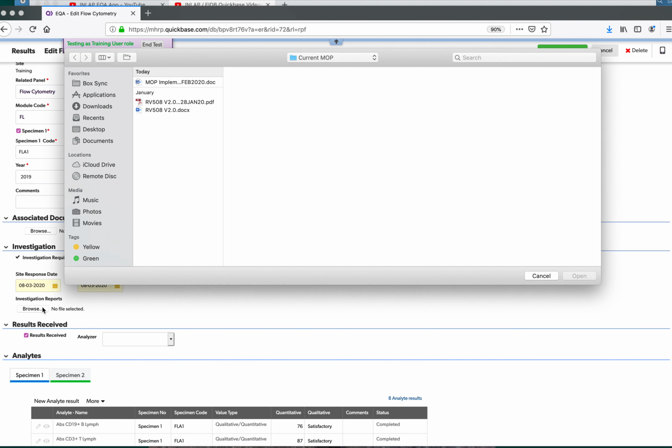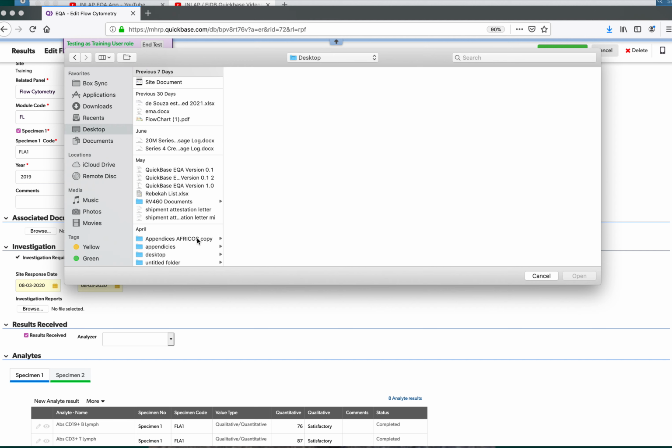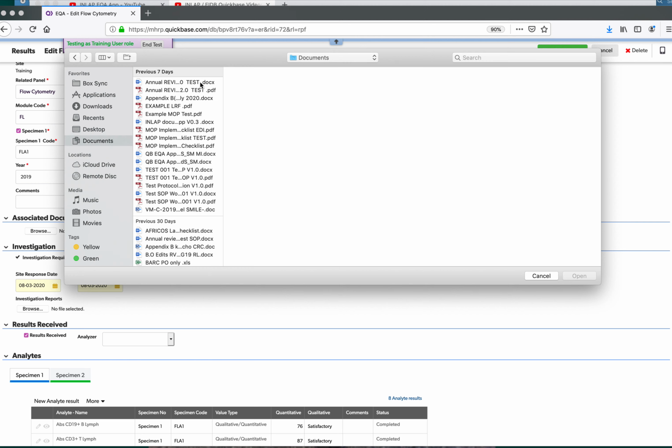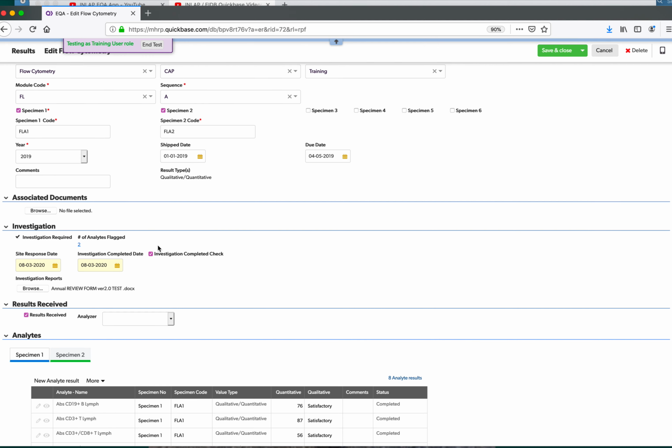Now I can upload my investigation report. So let's just go ahead and we'll just select a file, and we can just call this, we'll say that this is your actual CAPA. And here, this is what would be uploaded.